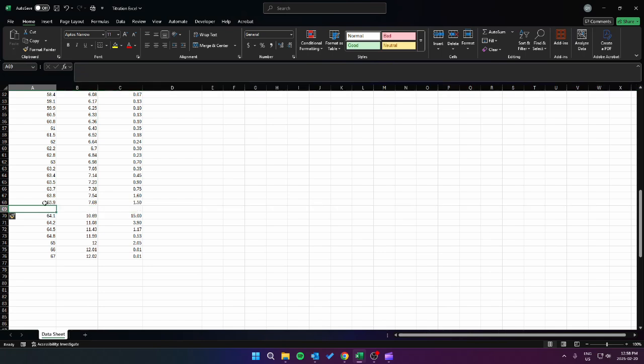And so we're going to calculate the average between these 2 points and put it in this cell. So again, using Excel's formulas, we're going to enter, bracket, this value plus this value, and bracket over 2. All right, and again, it's very important that we use brackets, right? Because we want Excel to follow BEDMAS, where it adds the 2 values first before dividing by 2. Now, if we hit enter, we learn that our estimate equivalence point is at 64 milliliters of sodium hydroxide.